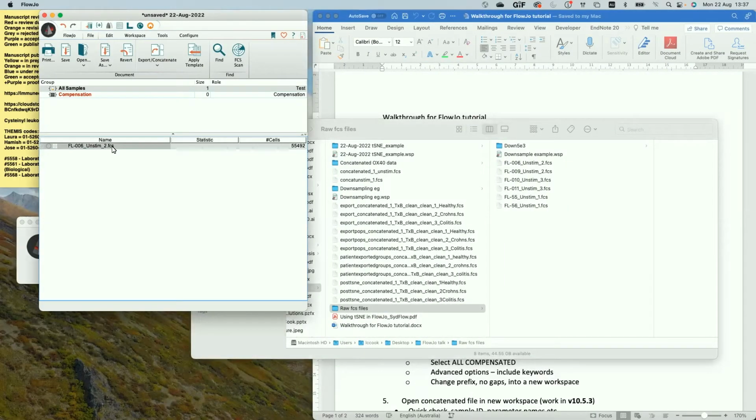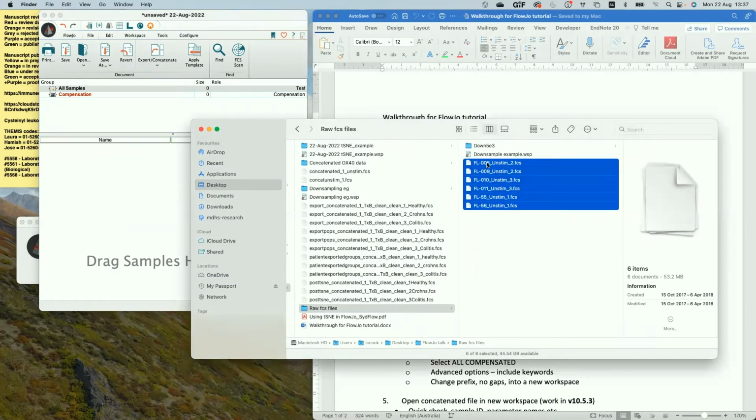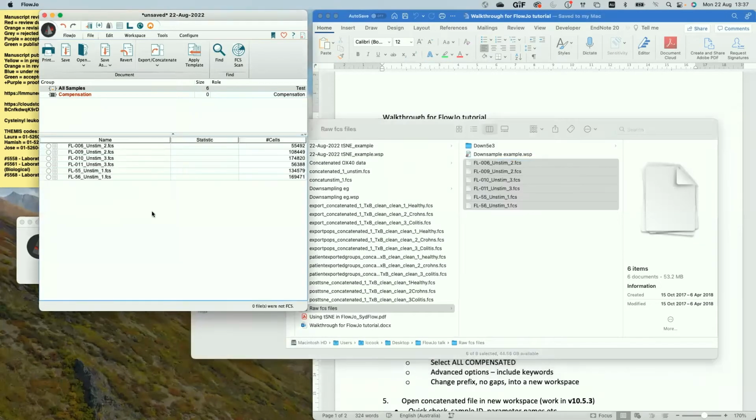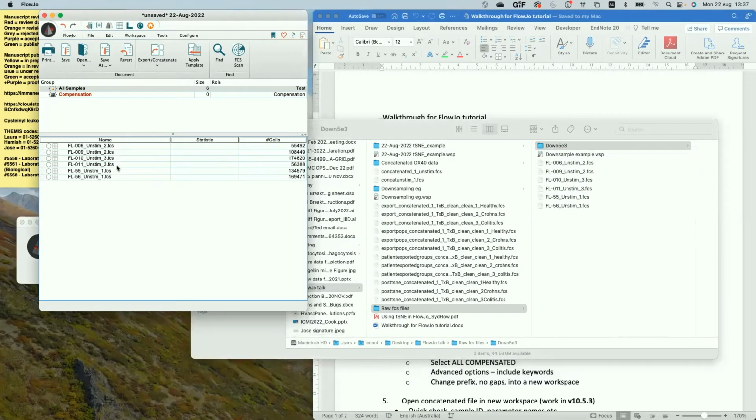So for a bunch of these samples, when you've done that and you've now got all of your samples of interest, and these might be the total cells here, you pull them into the experiment, because the next step we want to do is to put them all together in one file, to concatenate them together, to do some high dimensional analysis. So these are now all of your exported populations of interest. You want to come in here now and apply all the metadata that you want to these samples.